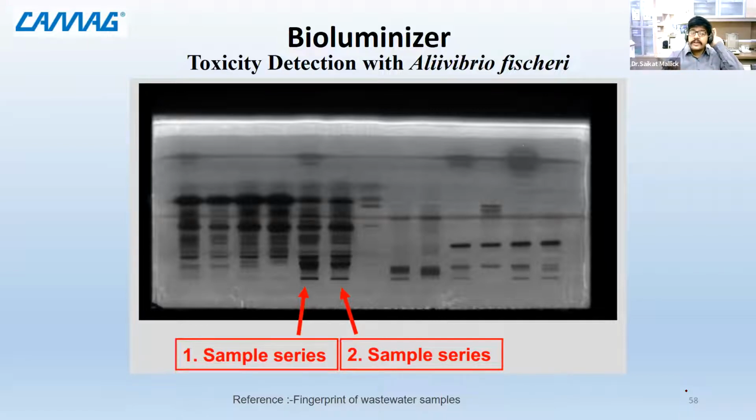You have to prepare the media. There's a phenomenon in microbiology to decontaminate it, autoclave. Yeah, autoclave the media in order to disinfect it. Then you have to add the bacterial culture into that, allow it to grow for around 3 hours. Then you take that culture, you pour it into a chamber.